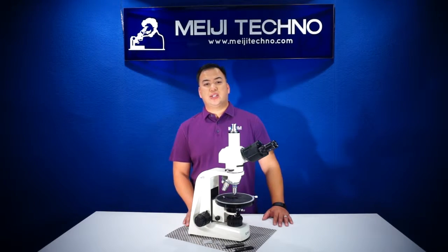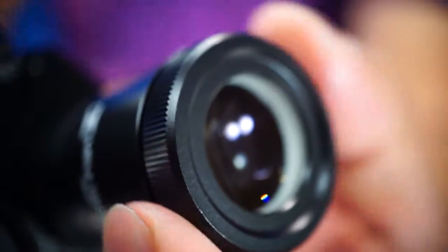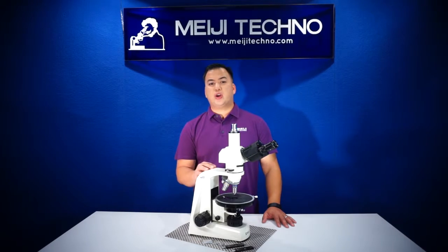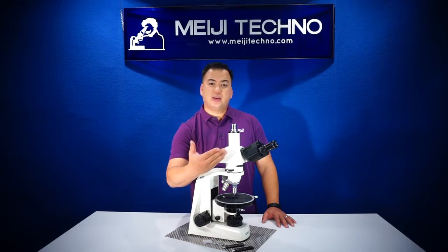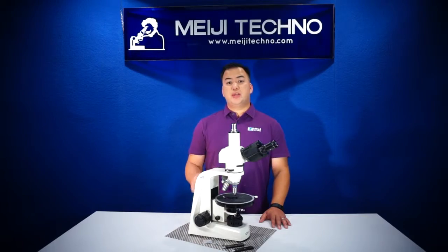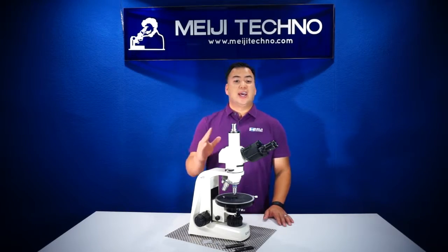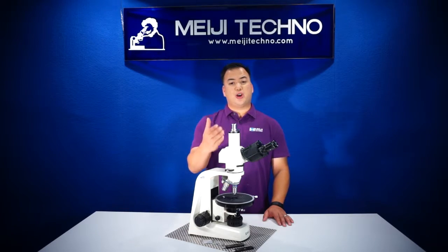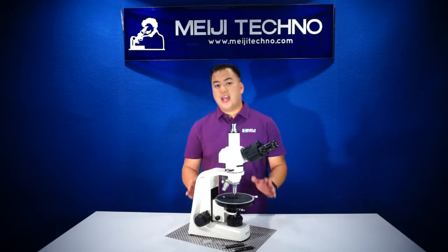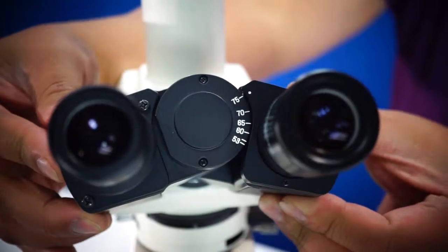The MT-9000 series is equipped with one 10X eyepiece and one 10X focusing eyepiece with a cross-line reticle. Available with a Siedentopf binocular or trinocular head inclined at 30 degrees. The trinocular head comes with an 80-20 beam splitter for image or video capture, meaning 80% of the light travels to the trinocular tube while 20% travels through the eyepieces. All heads have an interpupillary distance of 53 to 75 millimeters.